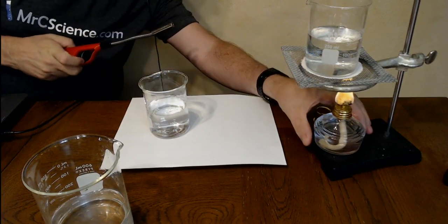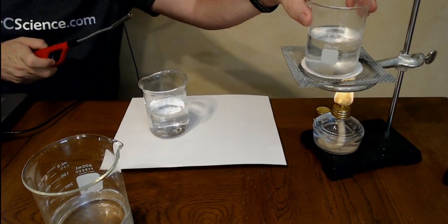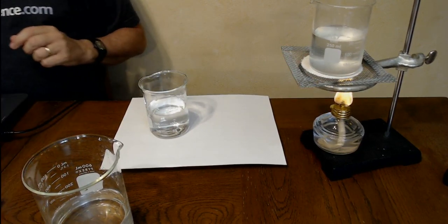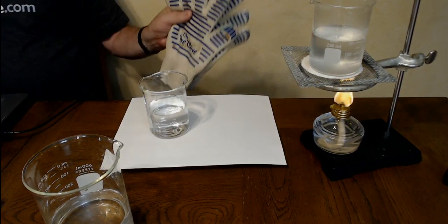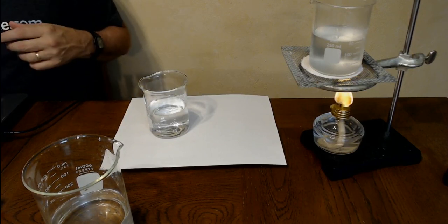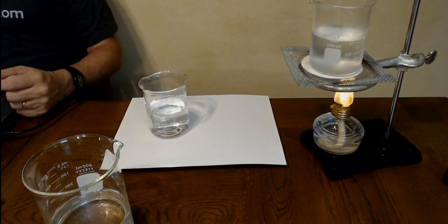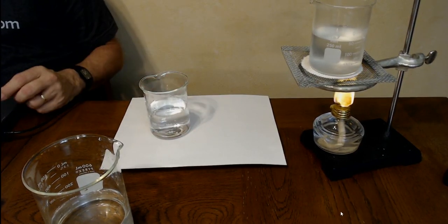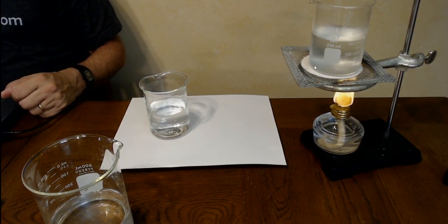There we go. Got that going. Excellent. So I got my gloves for later on when I have to take it off. So we're going to heat one up to pretty much boiling. So we're going to get it super hot. The other one I'm going to stick in the fridge here in a second.